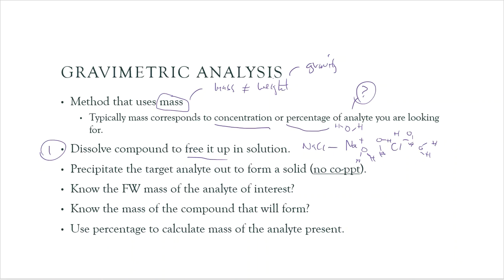All right, well, in this lab experiment, we're going to be doing the same thing. We're going to have a substance, and that substance is going to be a salt, but it's not sodium chloride salt. There's tons of different salts out there. We just call sodium chloride salt in layman's terms. It's kind of like a common name for it. But there's tons and tons of different salts. Well, we're going to take one of these, and we're going to put it in solution. We're going to add a solvent to it, and it's going to break it up into the ions, the positive piece and the negative piece. Now, keep in mind, the positive pieces are going to be called cations.